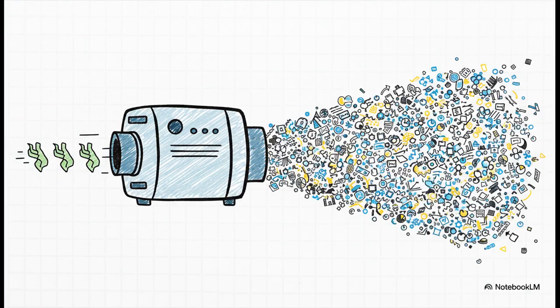Okay, to give you some perspective, think about a tool like the mass spectrometer. You can think of it like a set of incredibly precise molecular scales. It weighs the tiniest parts of our cells, the proteins, and in doing that, it creates this absolute fire hose of information from just one single sample, millions and millions of data points.